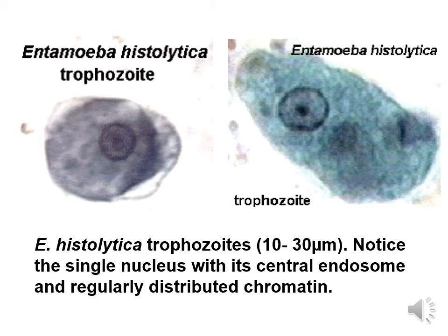But one characteristic which is helpful to identify Entamoeba histolytica is the nucleus. If you look at this nucleus, the nucleolus, or what we call the endosome, is in the center of the nucleus. And if you look at the margin of the nucleus, the membrane, the chromatin is comparatively smoothly distributed on the margin. So this is characteristic of the Entamoeba histolytica trophozoite, because there is another species known as coli, but the nucleus is not in the center. We call it off center, and the peripheral chromatin is not regularly distributed. It's irregularly distributed.